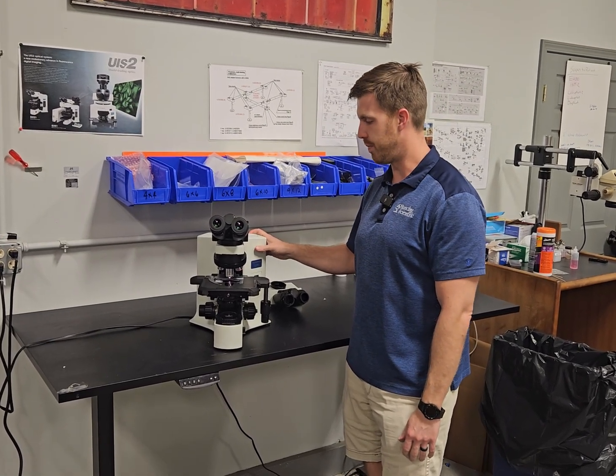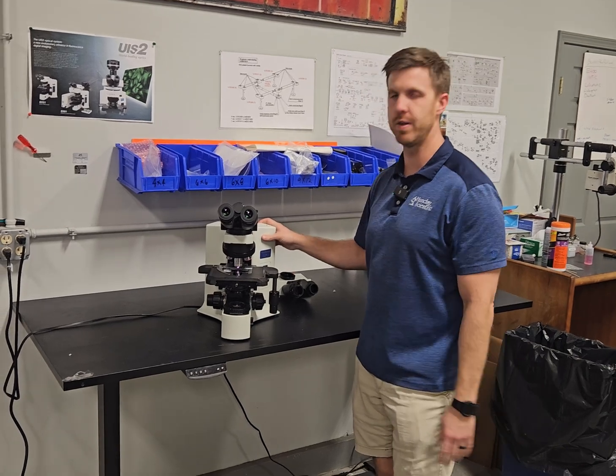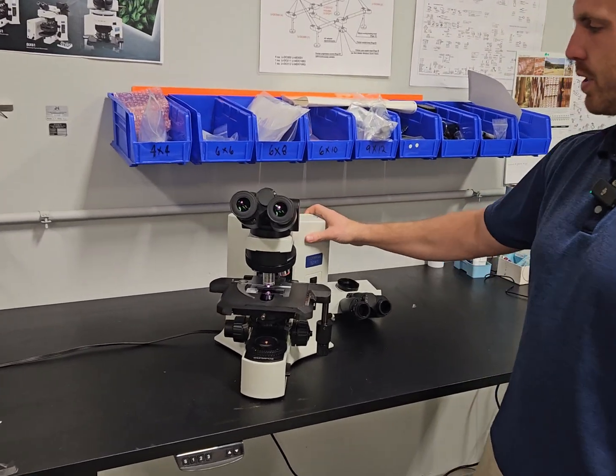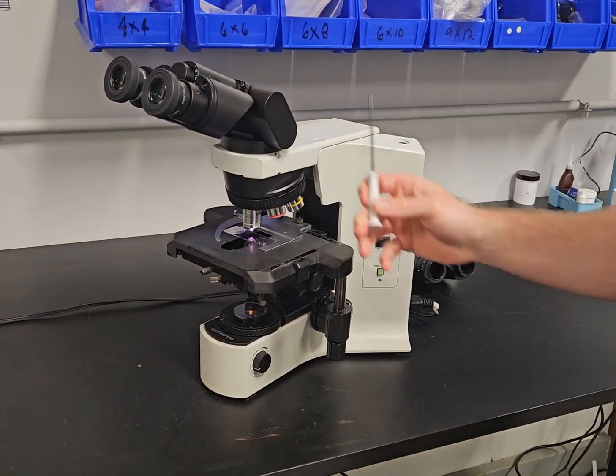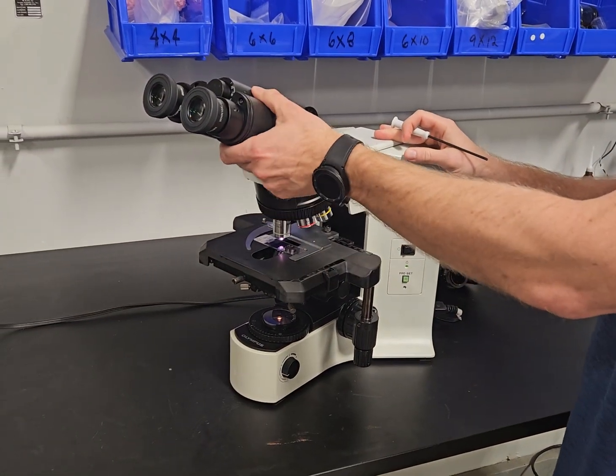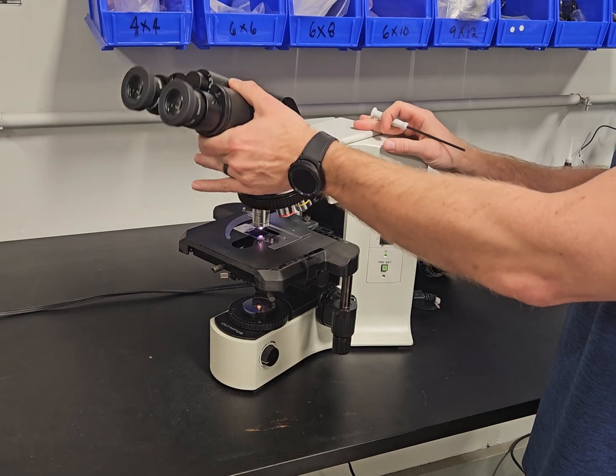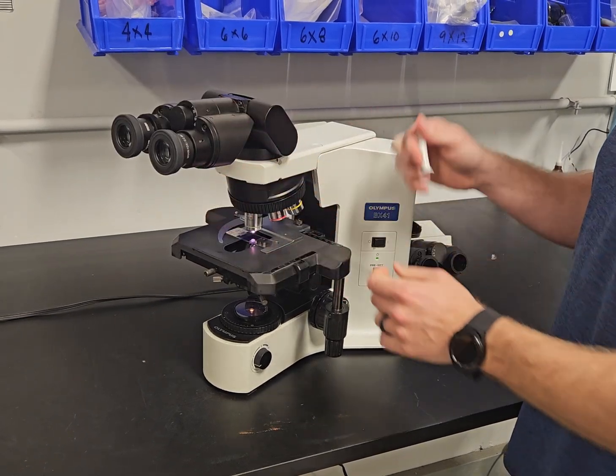We're going to come in and talk about some of the features and the options that we have. This scope has the tilting head on it. This is going to be the most common head that we sell on the scope. It's very ergonomic, tilts up and down.